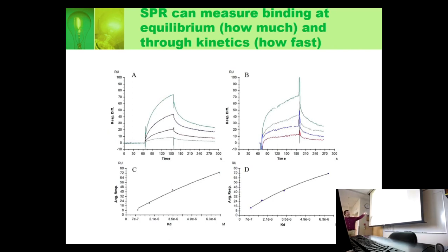Remember that you're putting different concentrations through, and you're measuring how high the numbers go. You can measure at this point right here. This point is where it's the flattest, you're the closest to equilibrium, and you measure just the height of that point, and you plot the height versus the concentration.